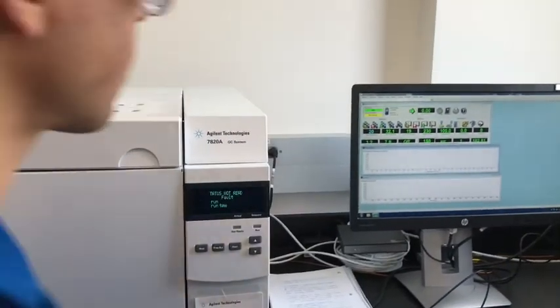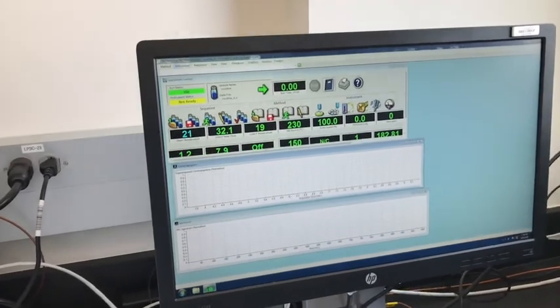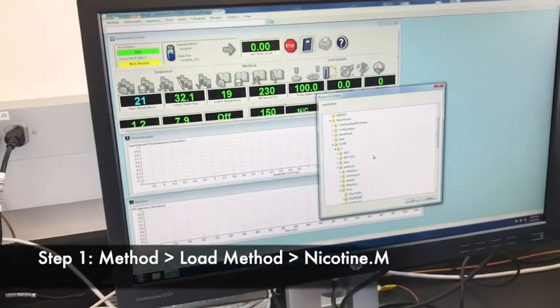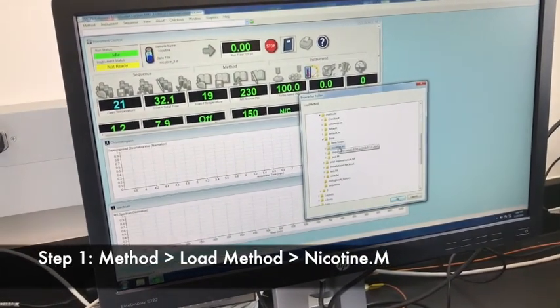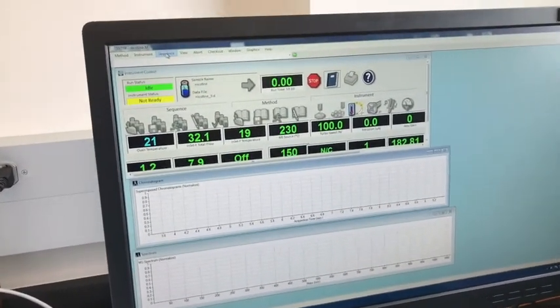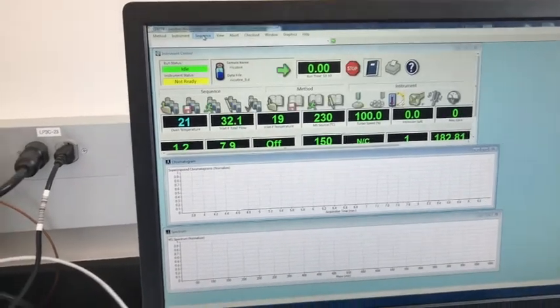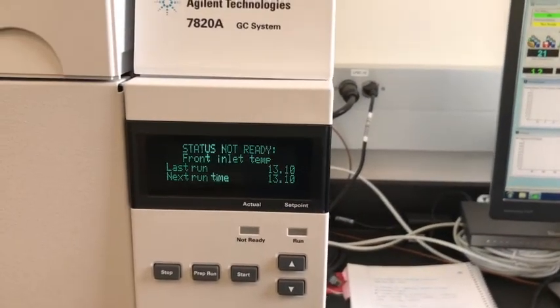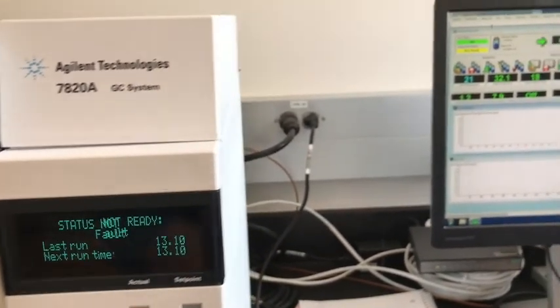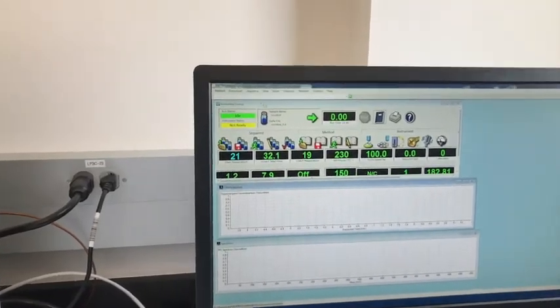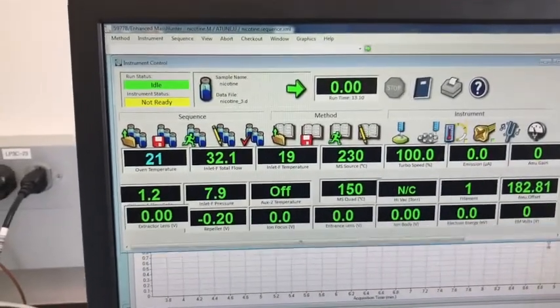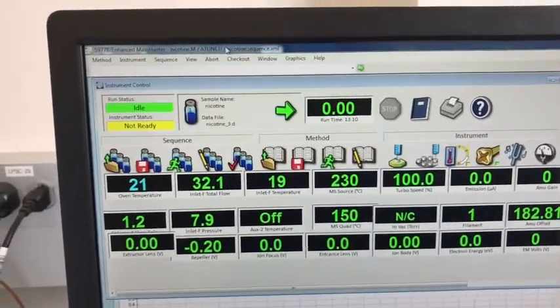To start our run, we first need to go to Method, then Load Method, and we load the nicotine method. While it is loading, we've got to make sure that if it's saying 'not ready,' we have to wait until everything is ready. Since I just opened up the column, the oven temperature is not yet ready.